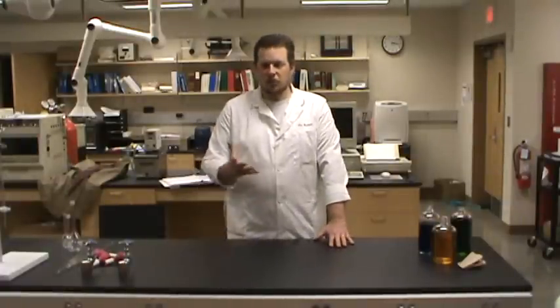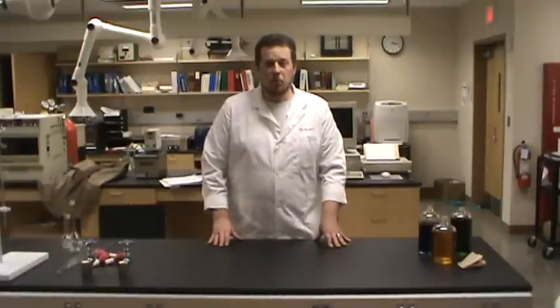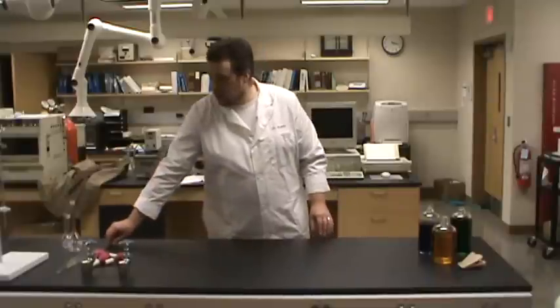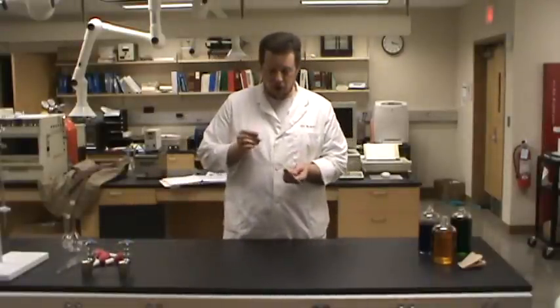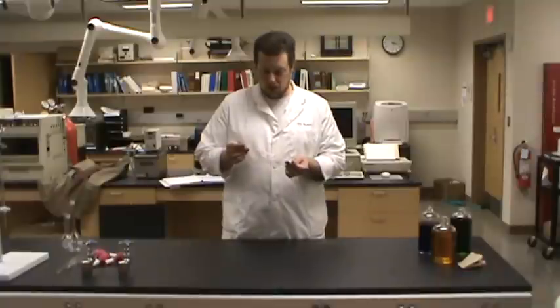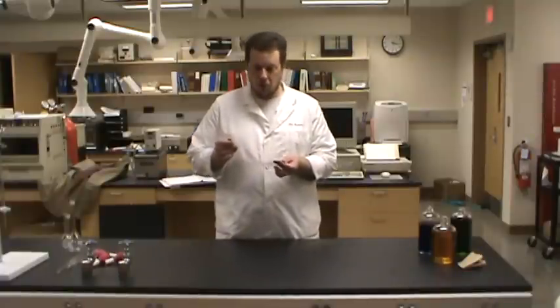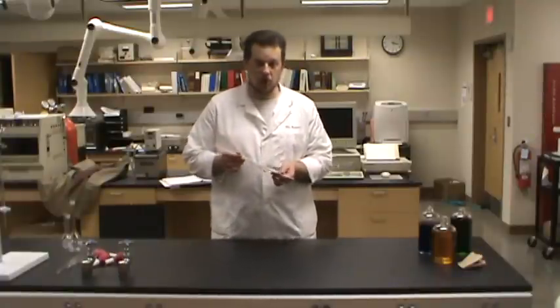So let's first talk about measuring an exact amount of liquid. Usually when we want to do that, we're going to use something called a pipette. So this is a volumetric pipette. Let's take a little tour of what we've got in this piece of glassware.